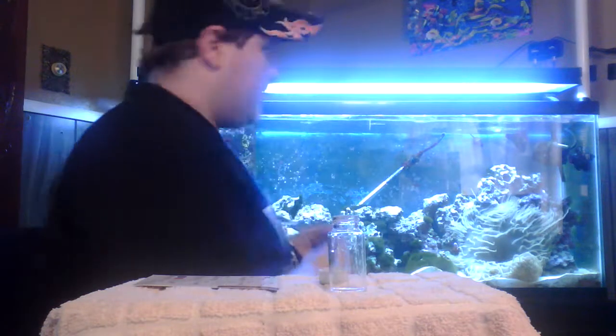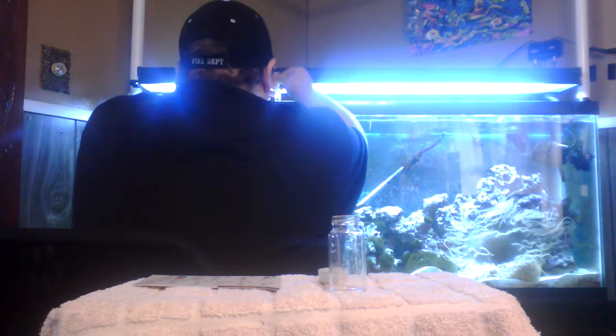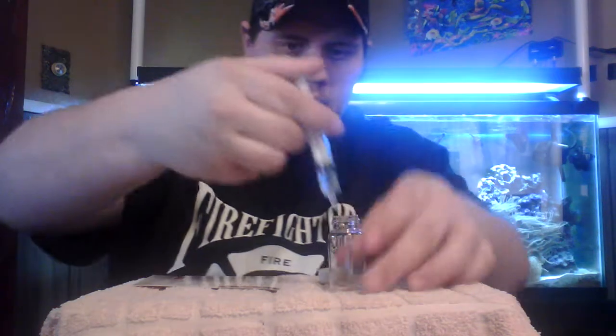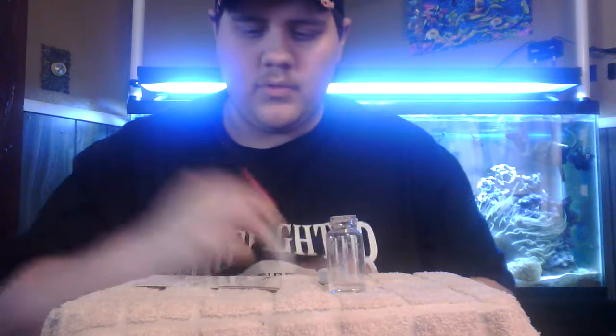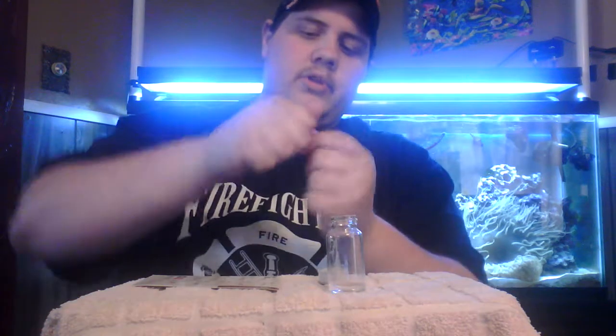Now we're going to get two milliliters of tank water and put that in our vial. Then it says you want to take Reagent A — one drop at a time, shake for 15 seconds, and you're going to want to do that five times. Just give your reagent a little mixing — you don't have to really shake it hard, just mix it up a little bit.